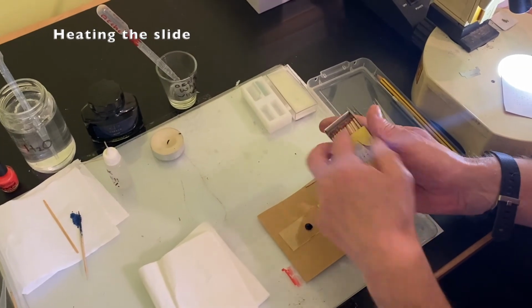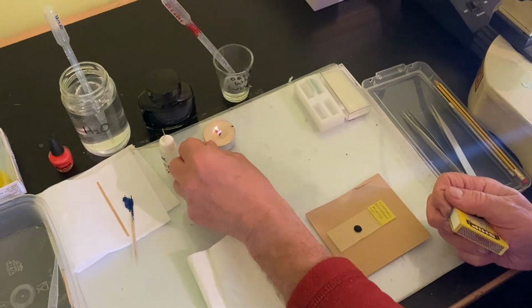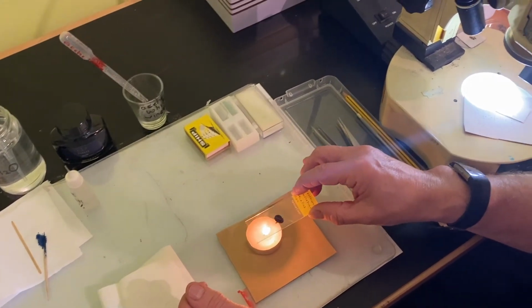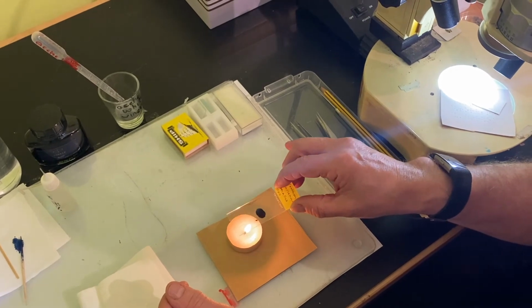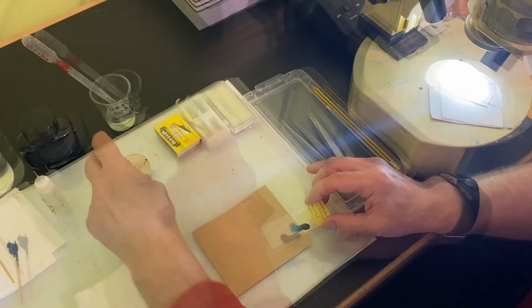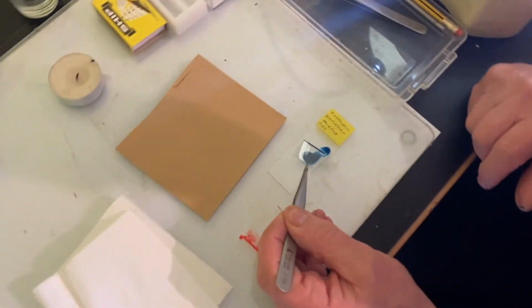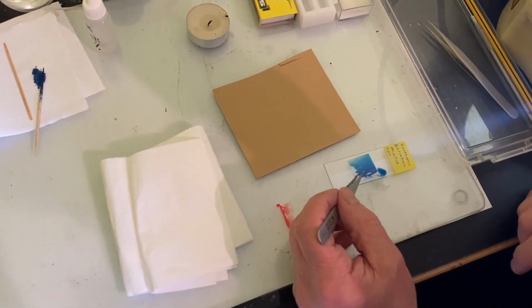Heating the slide. Light the tea light and warm the inked area of the slide over the flame. Hold the slide approximately 2 to 3 centimeters above the flame. The aim is to get the stain hot but not to boil it dry. Good heating facilitates good staining. Applying the cover slip. Move the previously prepared single cover slip from the cover slip box with the ultrafine forceps and lower it gently onto the inked area.